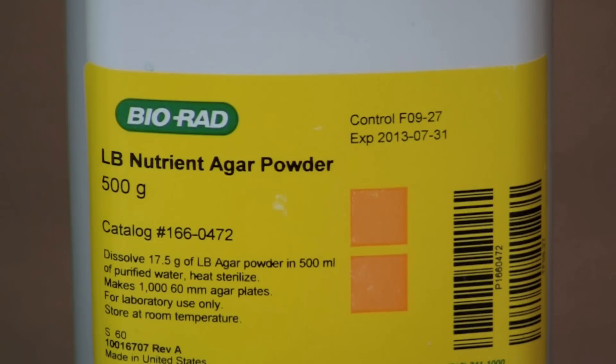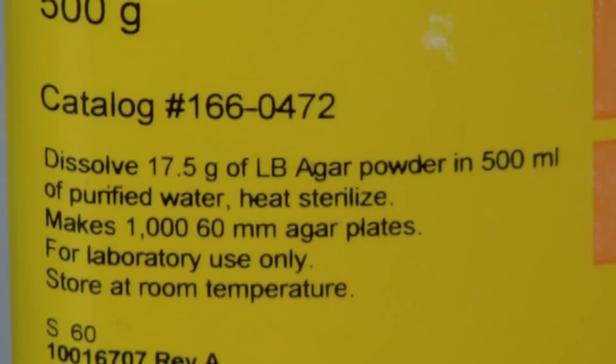For this activity we will be making 100 milliliters of microbiology media using LB nutrient agar powder. The recipe calls for dissolving 17.5 grams of LB agar powder in 500 milliliters of purified water to make 1,000 60-millimeter agar plates. This converts to using 3.5 grams of LB agar powder for the 100 milliliters of media we wish to prepare.